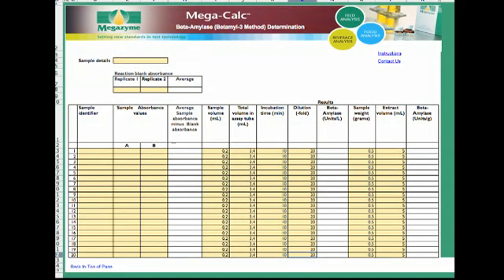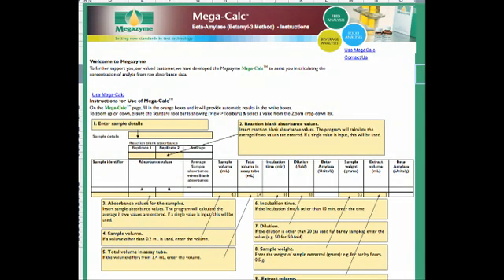The Megacalc calculation device is downloaded from the Megazyme website at the point where the product is listed. The device looks as shown here. The second page of the calculation device explains what the different parameters mean and gives an insight into how the calculations are performed.